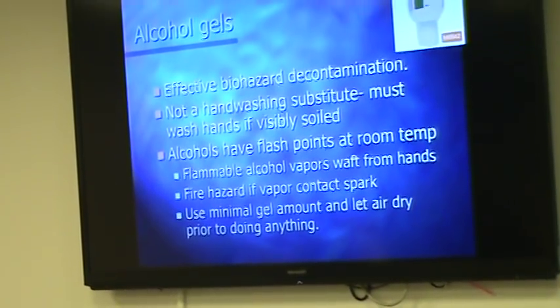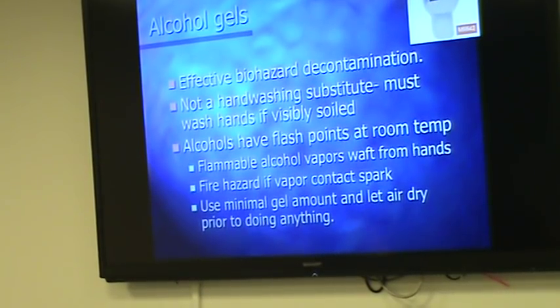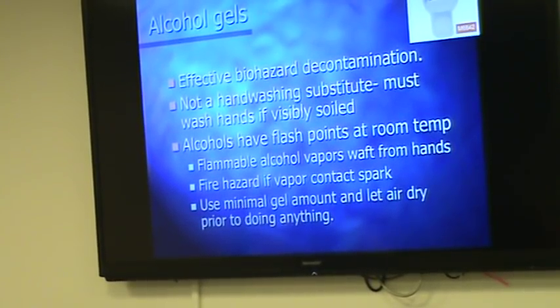However, if you have gloves and nothing that's been particularly unusual, alcohol gels are fine, with a couple of caveats. A lot of folks, because alcohol gels are sold to consumers and they're everywhere, think that, okay, this must be pretty safe. But a reminder that those alcohol vapors actually are at a very, very low flash point. There's enough alcohol vapor wafting off of your hand, and they've had people in healthcare systems get burned because their hands were still too wet, the alcohol was wafting off, and they've gone to switch on a light, or they've gone to do something that had just enough spark, and they had their hand erupt into little tiny flames from the alcohol gel, and that's happened more than once. So just be aware that it is still a tiny fire hazard. You're not going to burn the building down, but I bet your hand's not going to feel too good for a little while.